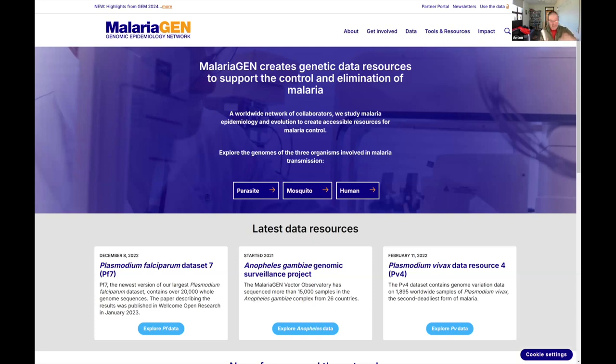In this case, I have two sites. I have southern sites and northern sites. And I want to understand, are there any genetic differences which differentiate these two geographic sites? So conceptually, it's a very simple experiment. You take your Illumina or Element reads, whatever you have, you map them to the genome, you call the variants. But against which genome would you map? In this case, you have five. How do you know which one to pick?